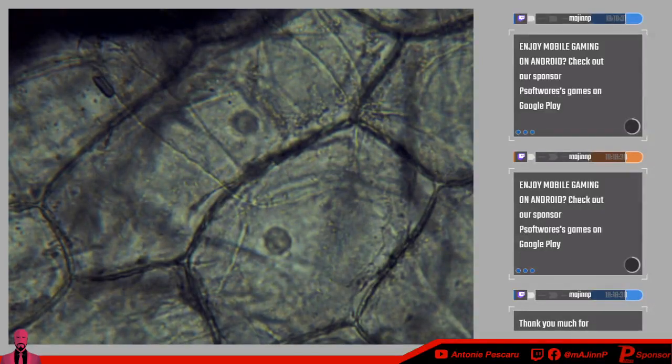So if one of them is missing a certain organic meal, if I can say it that way, I can't really think of the right word for it right now. But anyways, they share. It's like small gaps that they use. The plasmodesma is like small holes that are connected between the cell walls that are made in order for the cells to pass food around or energy sources.